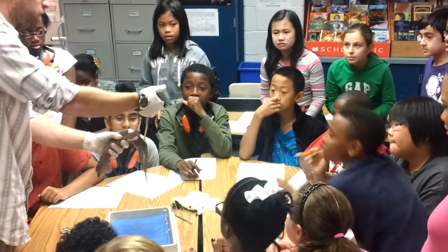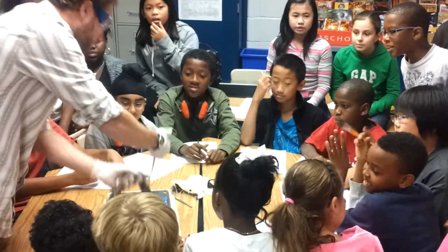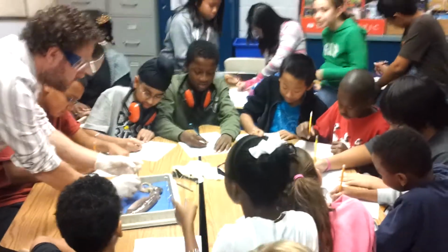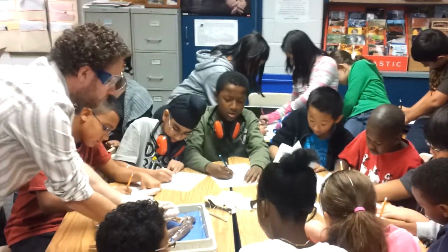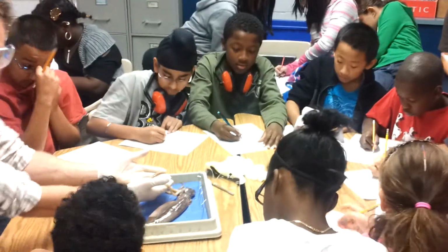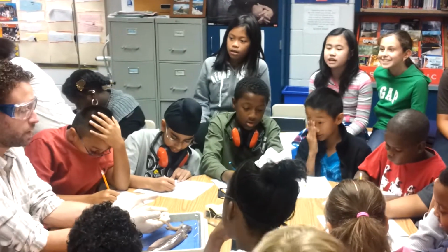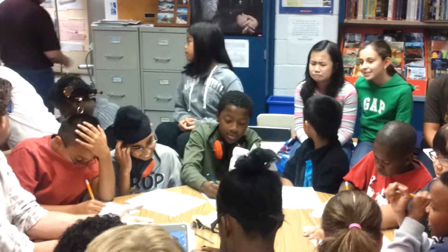And there are suckers or suction cups on the end. We'll get there. Please draw a picture of the tentacle. Just the tentacle. Remember, we're only looking at the tentacles. There are only 2 tentacles. Tentacles, 8 arms. Ew, they're hairy legs. Squidward's uncle. I see some great pictures of tentacles on these papers.